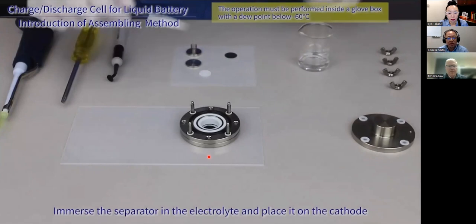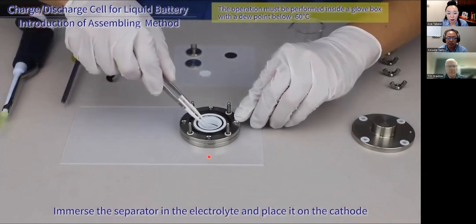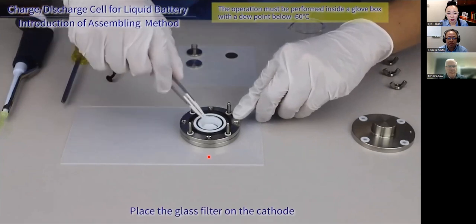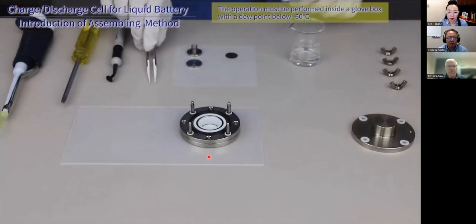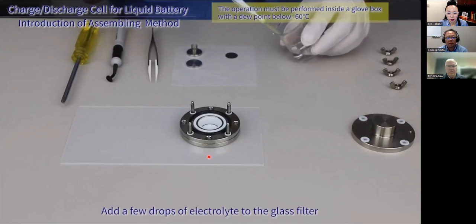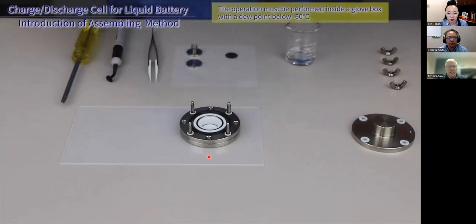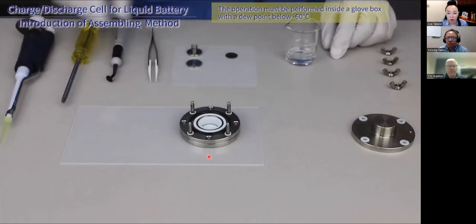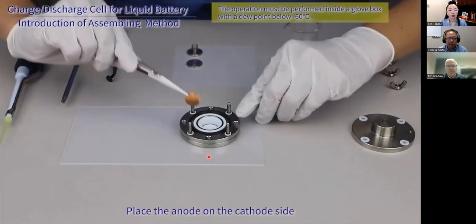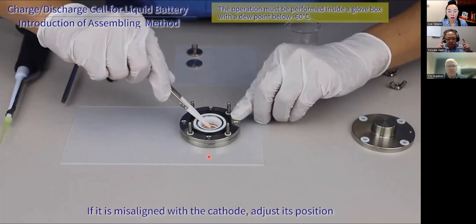Once you fix the sample holder, we put a separator with the electrolyte on it. Then we put the glass filter. If your glass filter is really dry, we strongly recommend dropping a bit of the electrolyte by micropipette. Then we put the anode. Make sure your anode surface is facing towards the cathode. Then we need to center the anode.